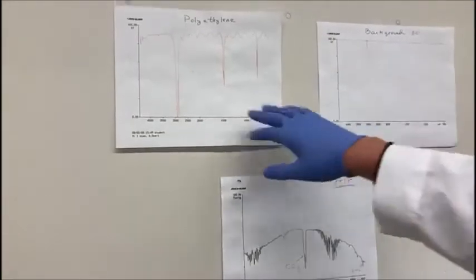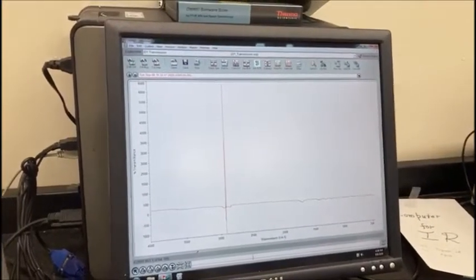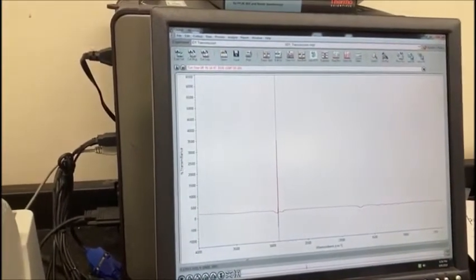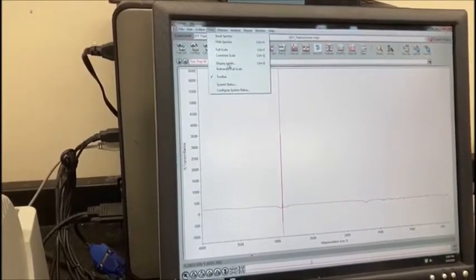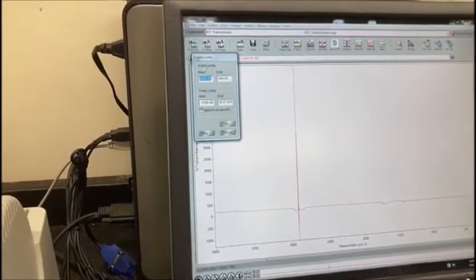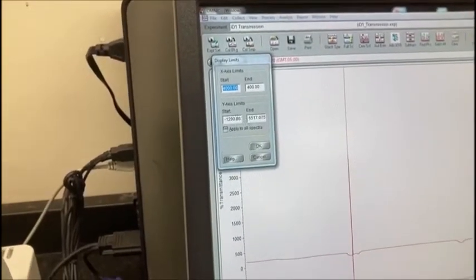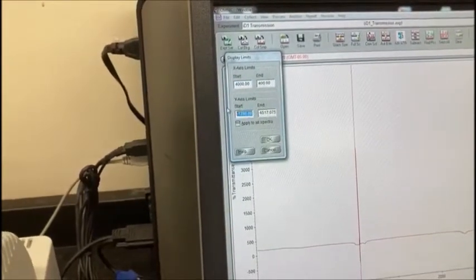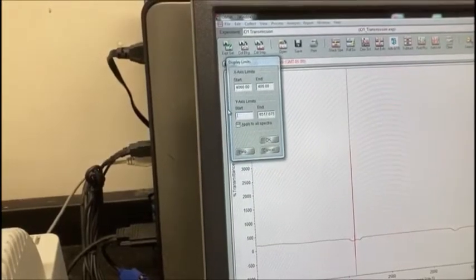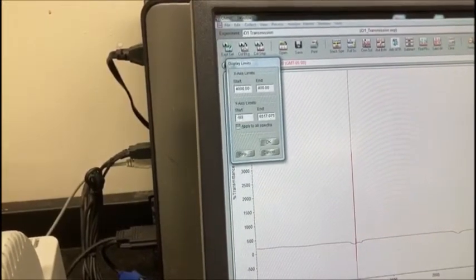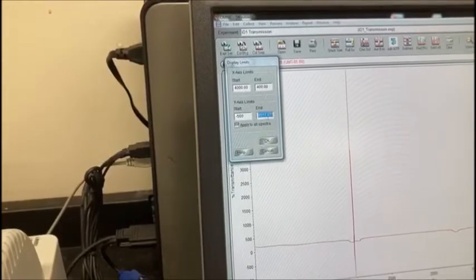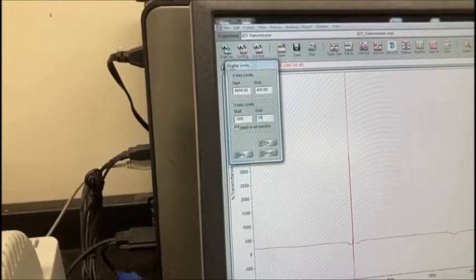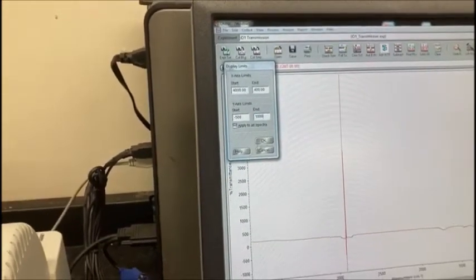To edit the axes right here, you'll go to this top bar and click View, and then you'll go to Display Limits. This is the x-axis and the y-axis. We'll put it to start at negative 500 and then end at about 1000 to see if that looks a little bit better.